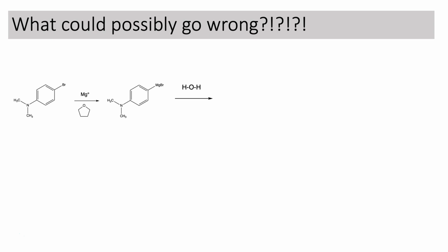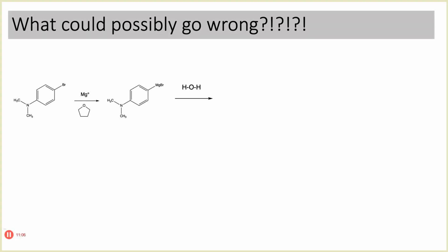All right, so what's so special about this reaction? Well, it's very powerful. We know it's a good reaction. So why is it technically challenging? Well, it's technically challenging because there's a really good electrophile that's around just about all the time, everywhere you go, and that's moisture. What could go wrong? Well, if you think about it, thinking about the fact that this is an anion, a good nucleophile, if there's any moisture around, what do I end up with?